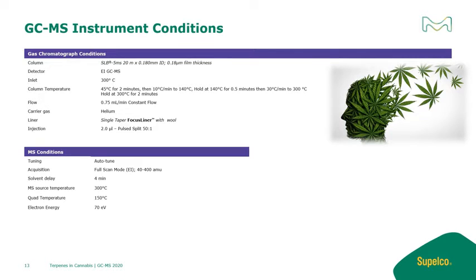It is very important to note that the 300 degrees C temperature is necessary on the inlet to ensure that some of the analytes, in our case phytol 1 and 2, are readily transferred onto the gas chromatograph column and reach our detector.